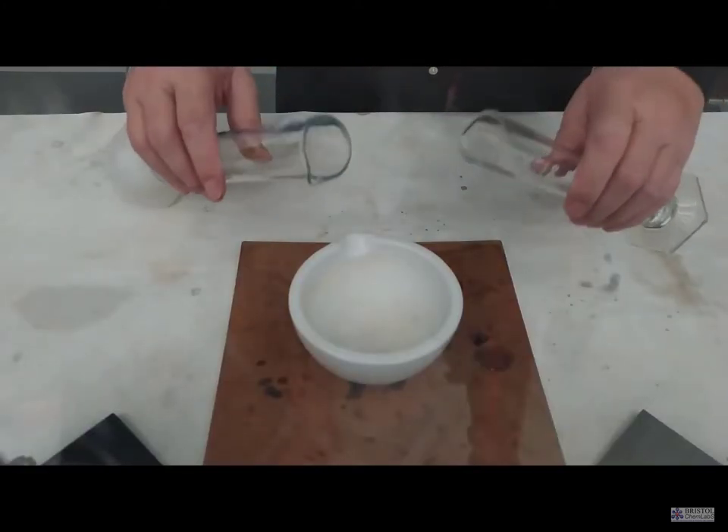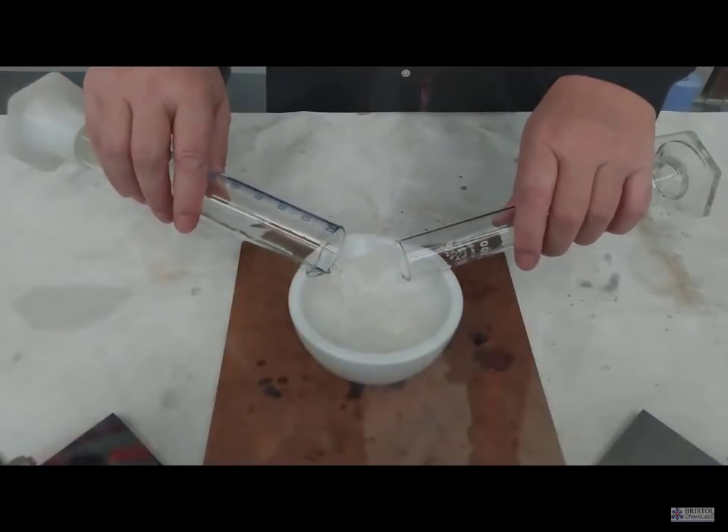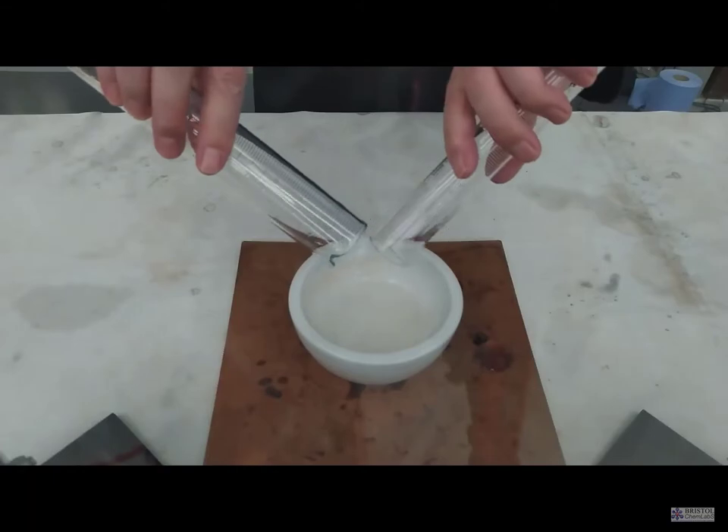The experiment makes a bit of a mess — you might want to protect your laboratory benches with an appropriate covering before you do the experiment, in addition to the safety screens and visors.